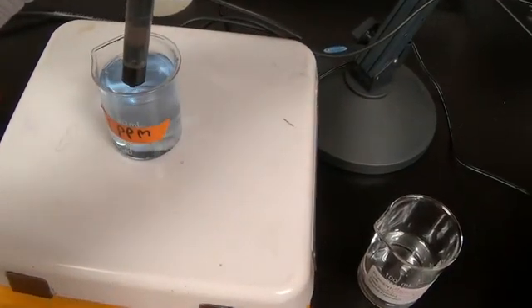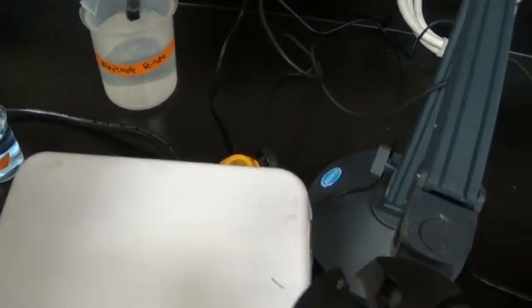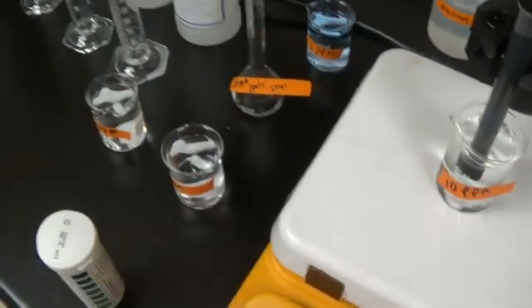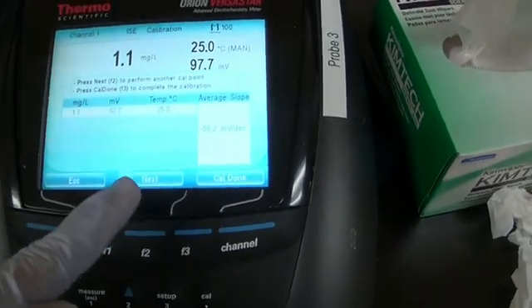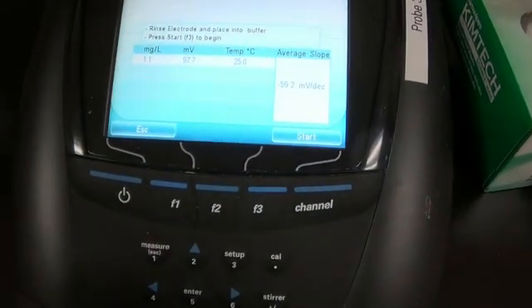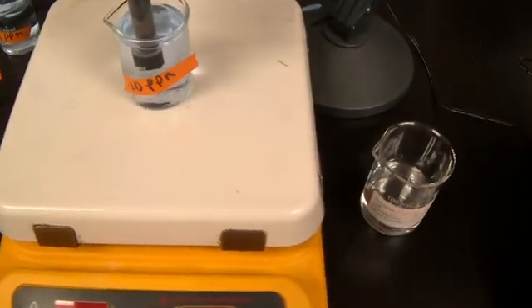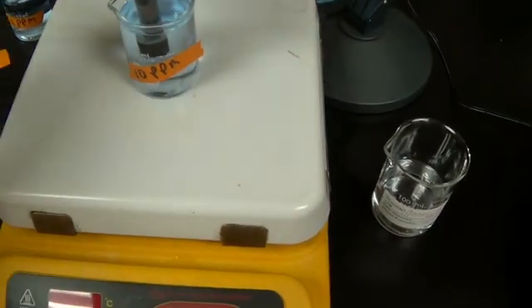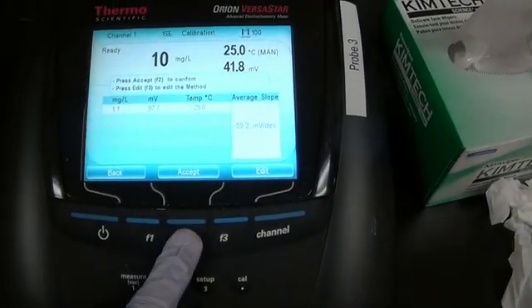Add our 10 ppm. Add our probe. Add our buffer. Hit next for our next calibrator. Start. Wait for it to stabilize. While you wait, let's check the pH. It is about 10 again. Alright, it is ready. Hit accept. Get probe out.